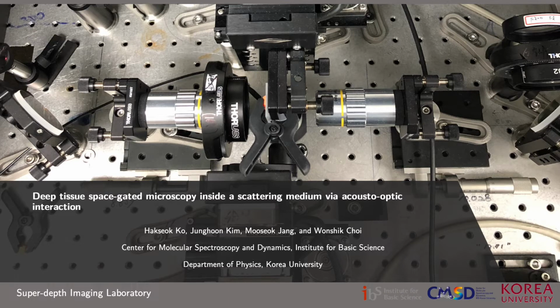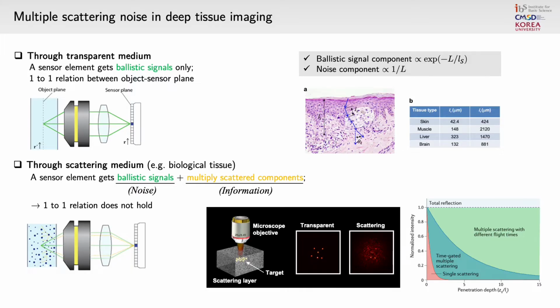This talk introduces a new optical gating method of imaging biological deep tissues, which we call space gating. Improving the imaging depth of optical microscopy has been a long-standing goal in the field of bioimaging. While imaging with light provides good enough resolution for observing from tissues to cells, intracellular structures, and even biomolecules, imaging capabilities experience severe difficulties when imaging thick, highly diffusive biological structures.